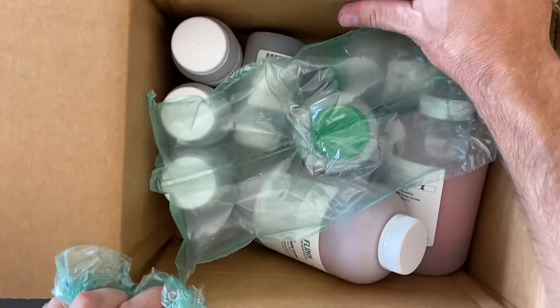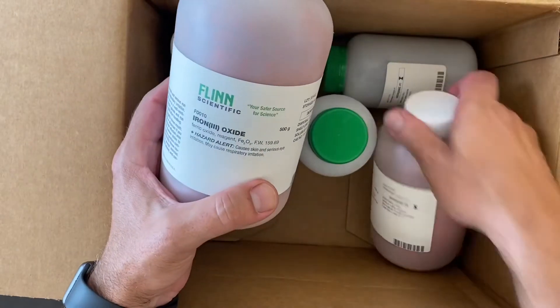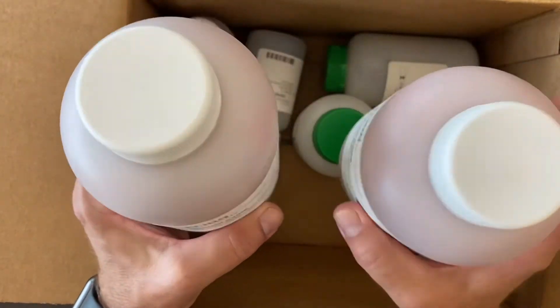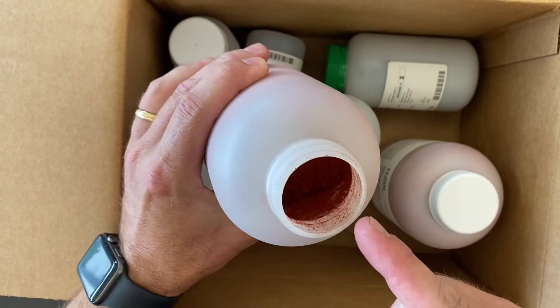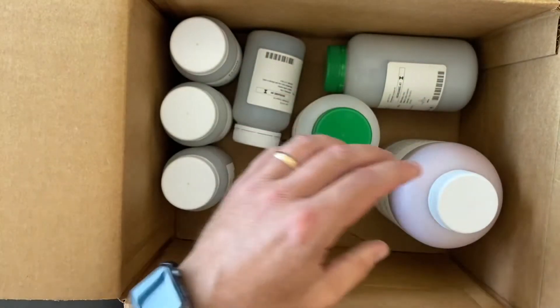Here's a smaller box with some smaller bottles. These two reddish ones I knew right off the bat were going to be iron oxide — basically rust. You can tell the color through the plastic, but let's take off the cap so we can enjoy the color of just pure rust. We'll use that for some thermite, which is fantastic.